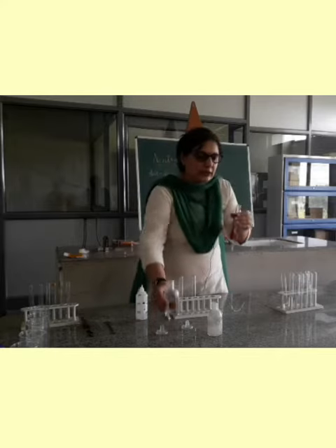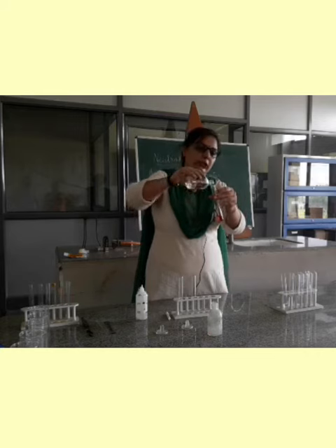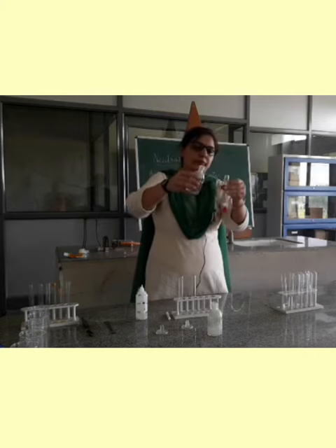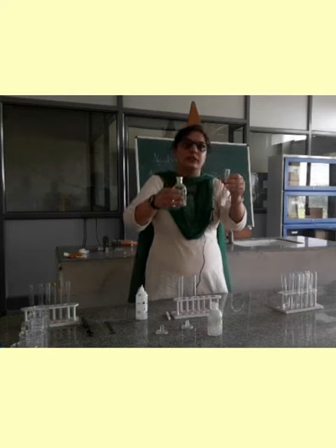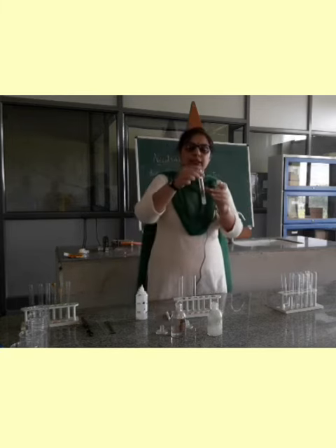To this, I will be adding acid to neutralize it. And when I will add acid, it should be added in a quantity such that it will turn colorless. Now, it has turned colorless. So, it indicates the solution is now neutralized.